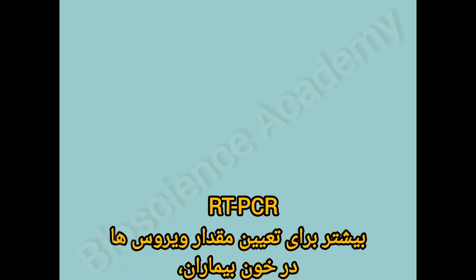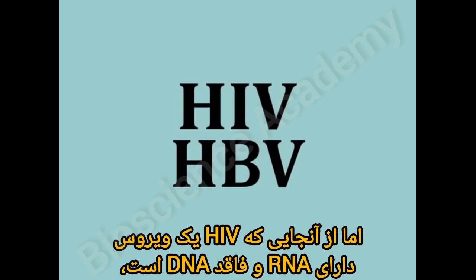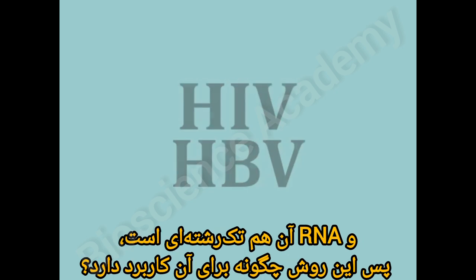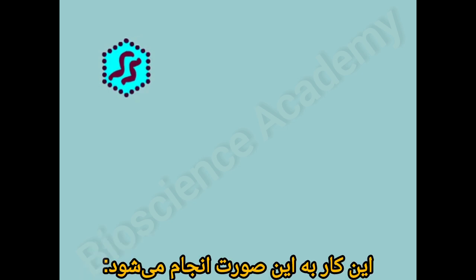RT-PCR is most commonly used to quantify the burden of viruses in the blood of patients with HIV, hepatitis B, and other viruses. But HIV is an RNA virus. It has no DNA, and the RNA that it possesses is single-stranded. So, how can this method work? The answer is that RNA from an RNA virus can be quantified after it has been copied and converted to double-stranded DNA. This animation shows how this is accomplished.